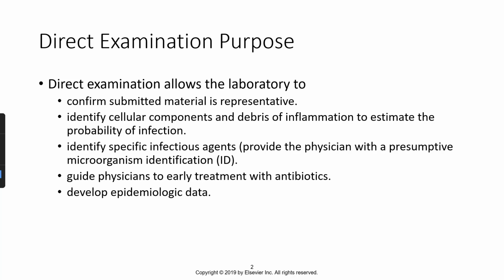Treponema pallidum is the causative agent, so we would then call up to the floor or report the results as preliminary, but we can give them that information so that they know what antibiotics to start the patient on for treatment. Guide physicians to early treatment with antibiotics. Again, that goes along with what I just said in the previous statement.